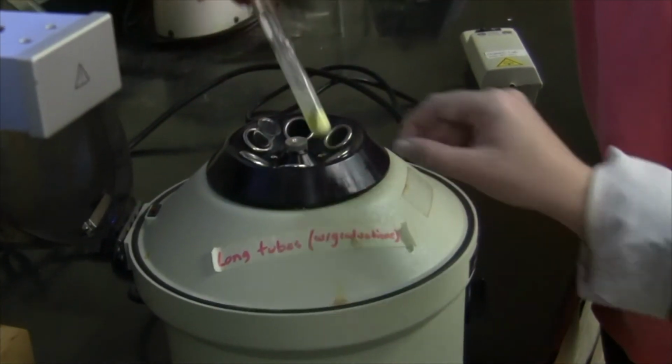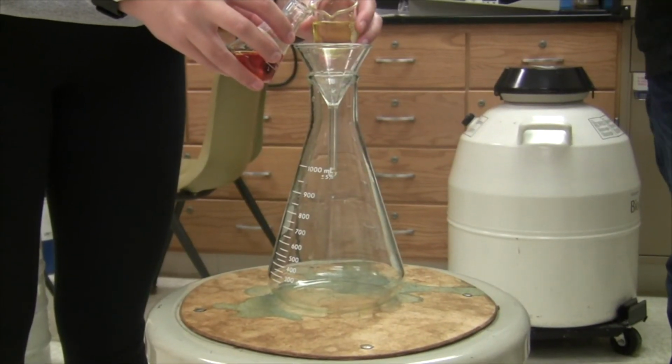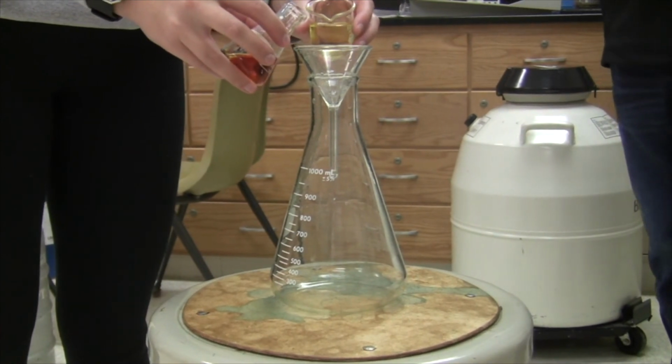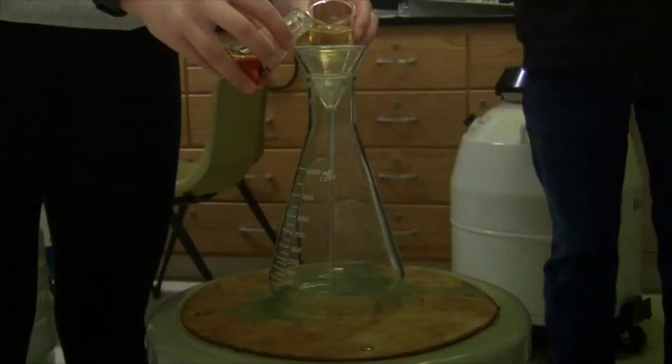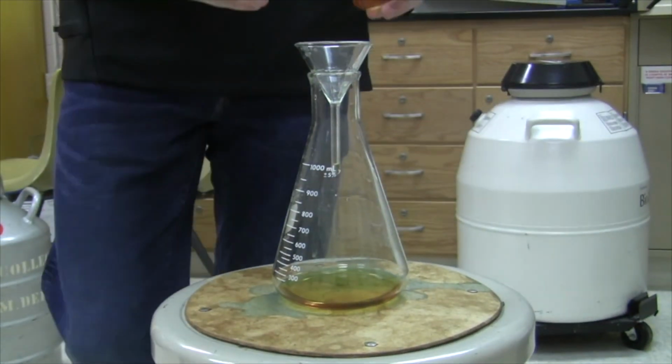With the solid remaining in the test tube, we're ready to move on to create our individual solutions, and then in a darkened room, pour them together and look for the luminescence. Here's the resulting luminescence from 2 students. Sometimes the color varies a little bit, but more often it's the brightness, and that variability has most to do with the relative purity of the samples.